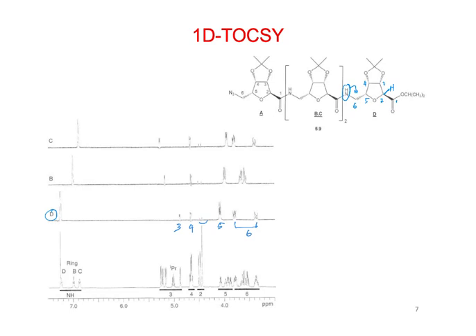And then for B, it would be the same thing, right? In B, well, they have B and C together here. But in each of these cases, it's going to be from the NH into that whole ring spin system. So for B and C, we can pick out all of the peaks, and we could identify them in our one dimension spectrum down here, which ones go together to each different unit, right?